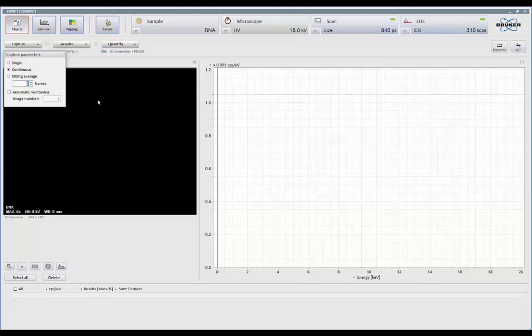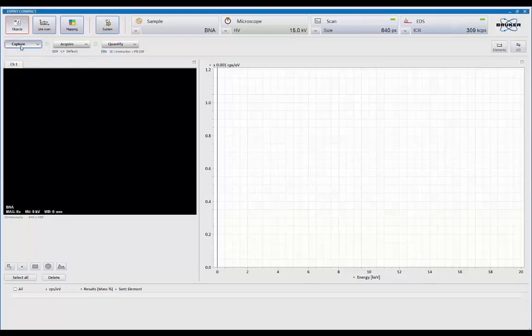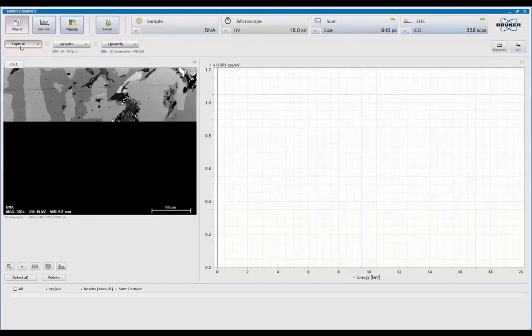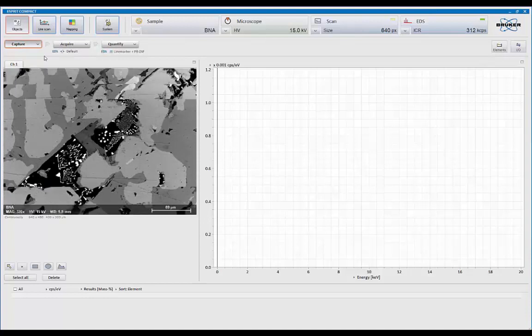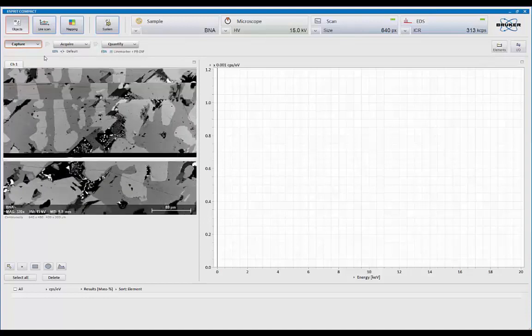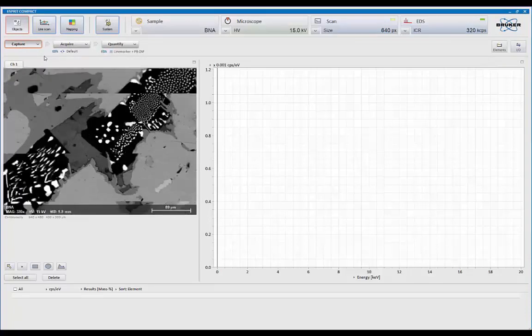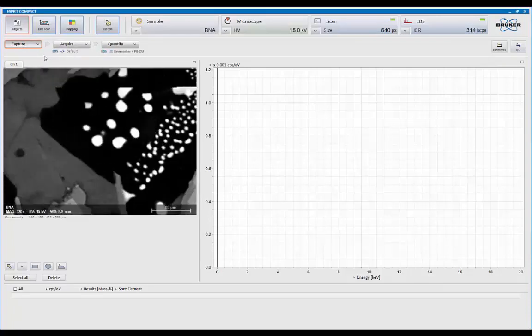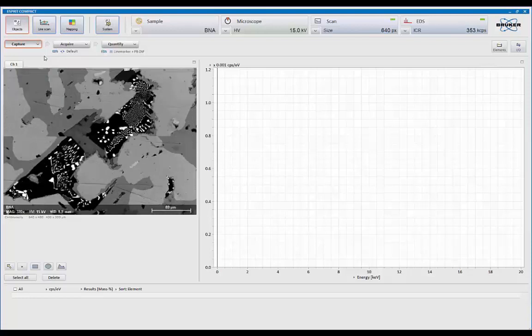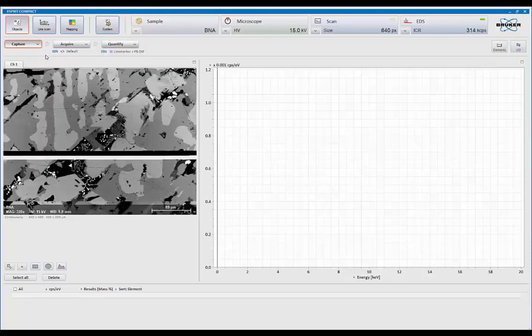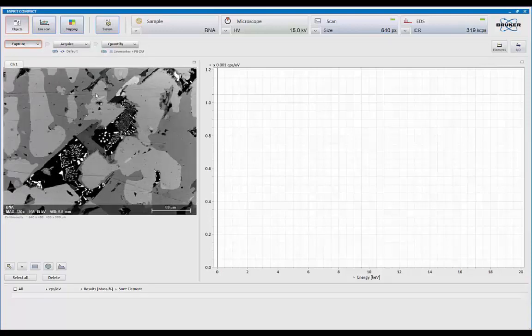So right now with the continuous, I hit capture. There's my image coming in. And as you see, it's fast enough that I can focus, zoom, stigmate.